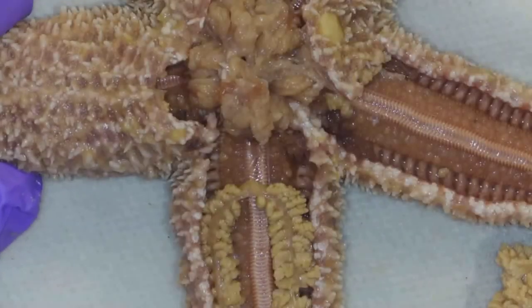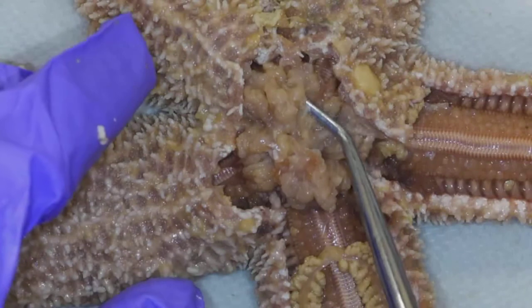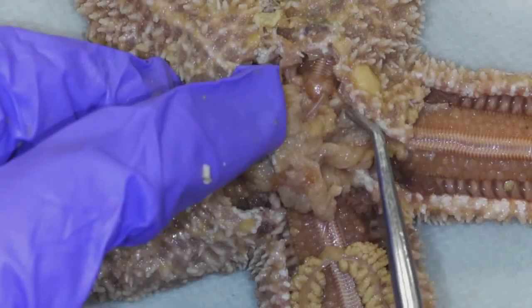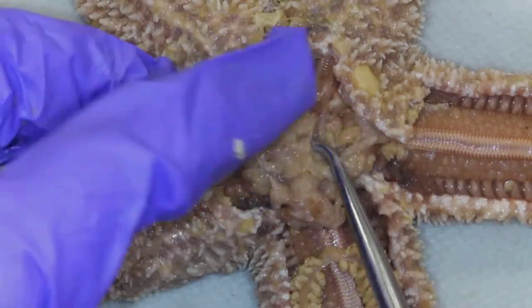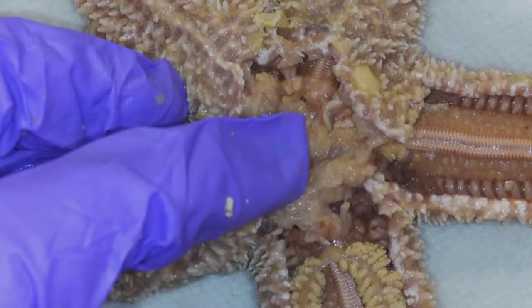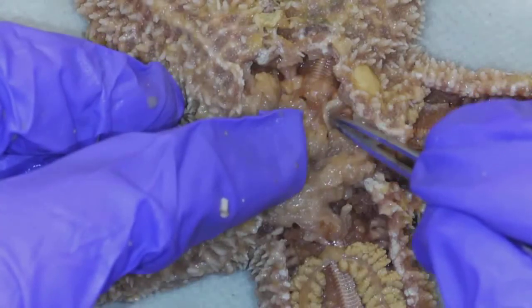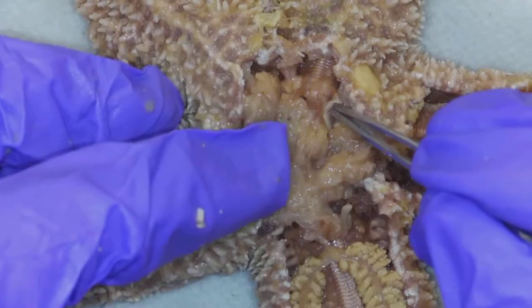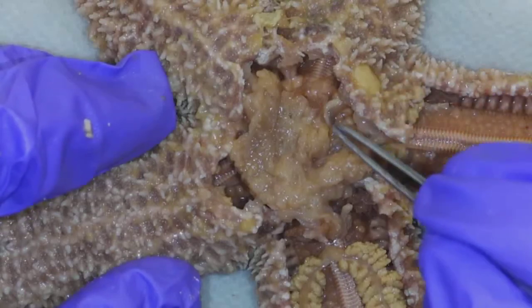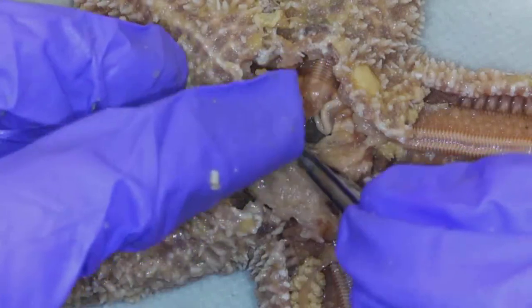Other features that I can see here — I do still have the madriporite right here. If I move the stomach aside, I can see part of the water vascular system. Can you see this white structure going here? It's the same color as the madriporite, and this white structure that goes down here — that's the stone canal. Water is going to enter in through the madriporite, and it's going to go down the stone canal. I was very careful when I was cutting so that I did not break the stone canal.